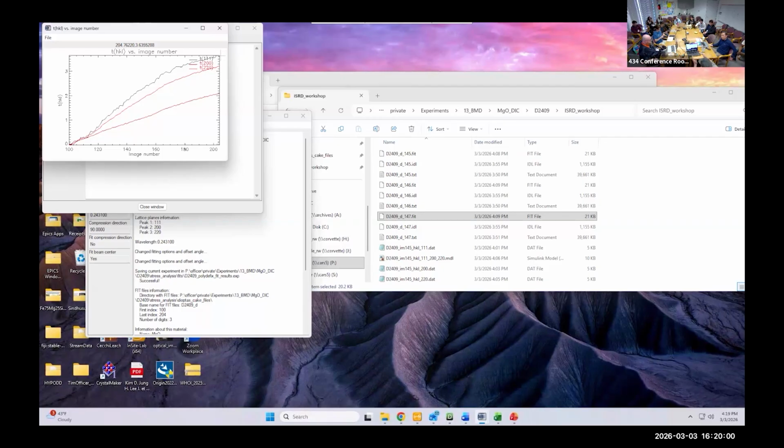They orientate differently. So yeah, it's related to the orientation. Like an HKL is a different lattice plane. So you'll have this lattice plane, which is like this difference away. But you see they're the same at the beginning, and then they split off. So this is the elastic region. But when they split out is when you start getting into plastic deformation.